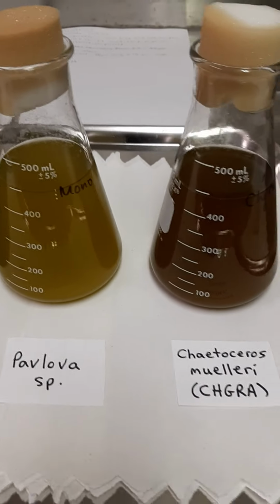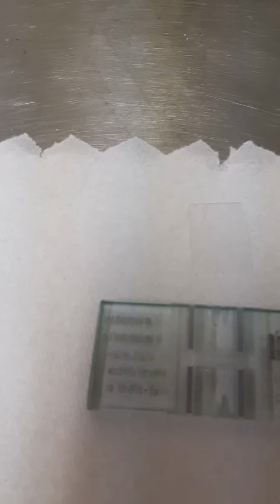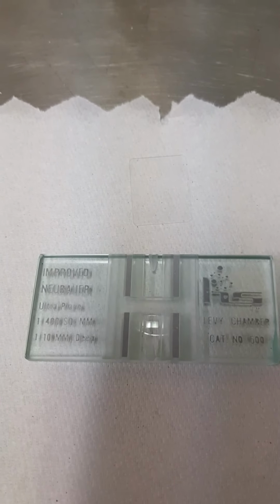So what we normally do then, when we get all of our algae, we take a sample and we use a special slide called a hemocytometer to look at your algae through a microscope. So you just put your sample on the little wells right here and here, and you use this cover slip to put over the sample. Then you're able to look at it through the microscope.